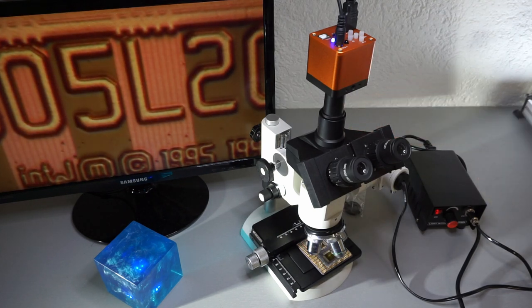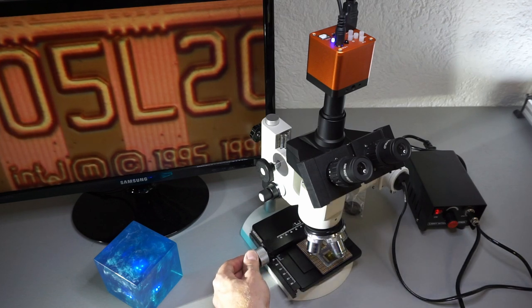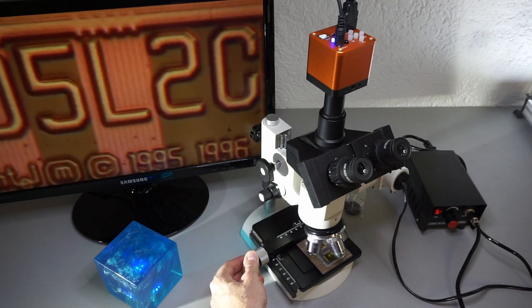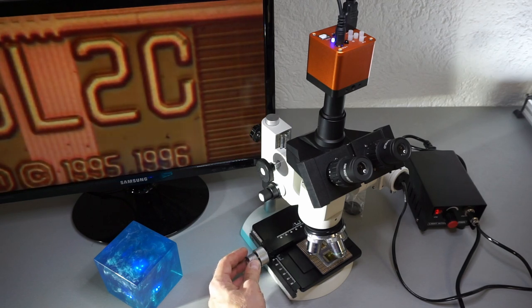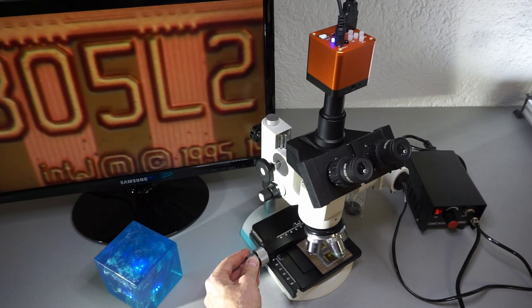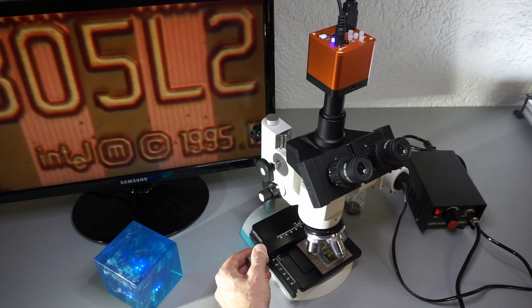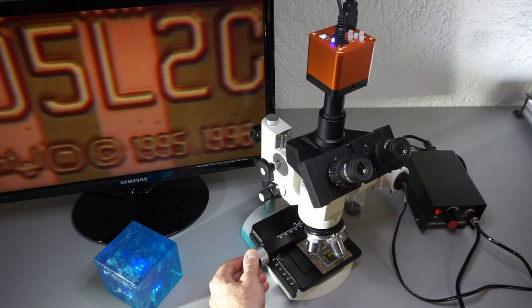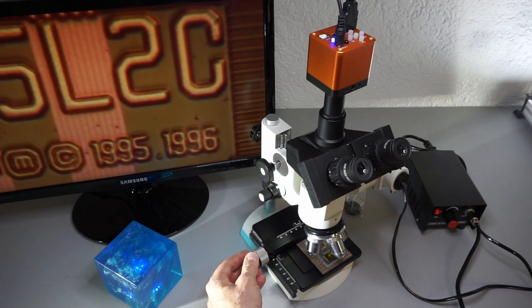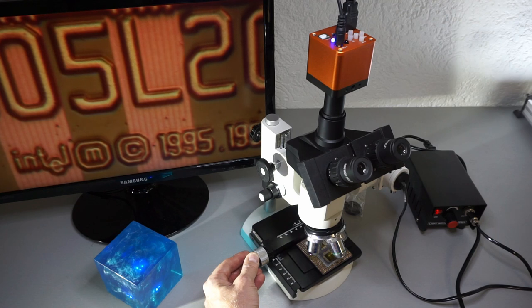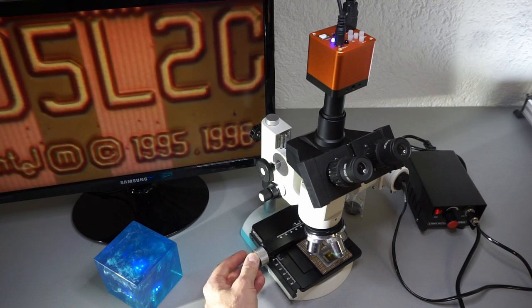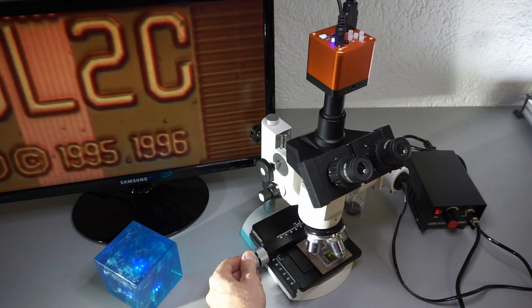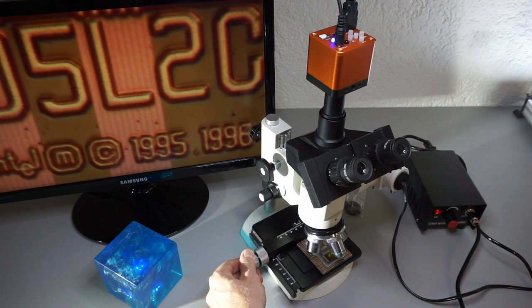Yes! Wow, look at this. Using the stage... wow, the stage is very sensitive, which is nice. I can smoothly move up and down, back and forth. What I clearly see here is the 805L2 cache, which is the signature for the second level cache chip on the Pentium Pro from 1995. Super happy, it looks really great.